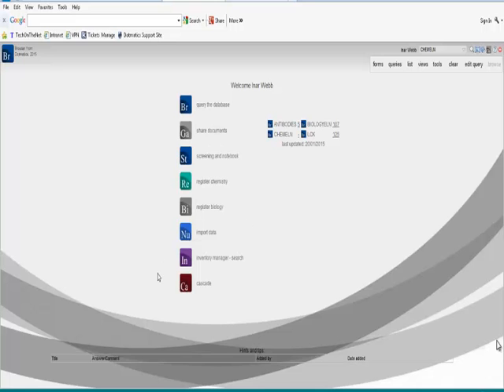So I've logged into a user with a lot of the icons you may have seen on the last slide. These are just sort of, I guess, a pseudo-periodic table of functionality, the different components of the software. And it's a very flexible design of the application. So we have customers that use just maybe a few of these modules, or others, such as Roland and his team at AstraZeneca, who use pretty much all of it. So I'm going to take you through a few of these modules and this functionality right now, and we'll have a look at how it's used in real life.